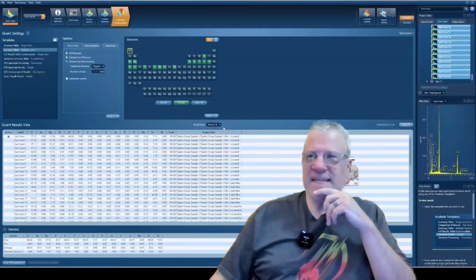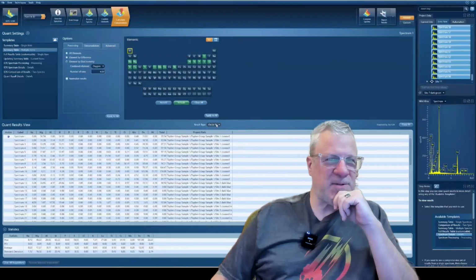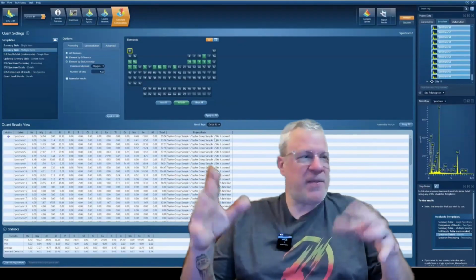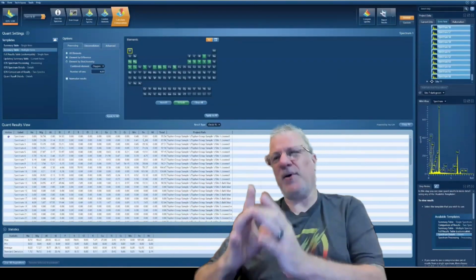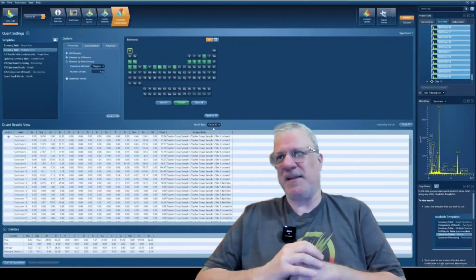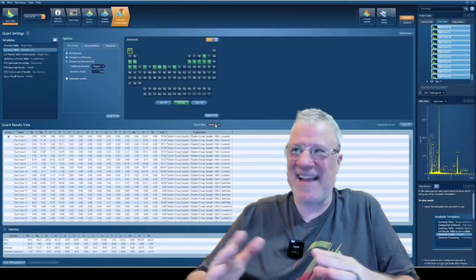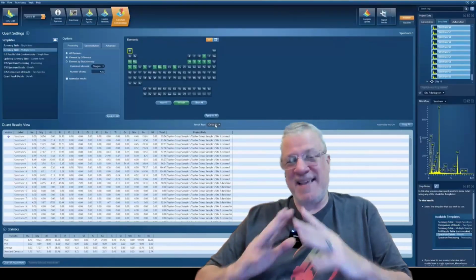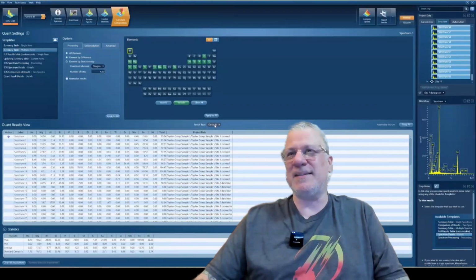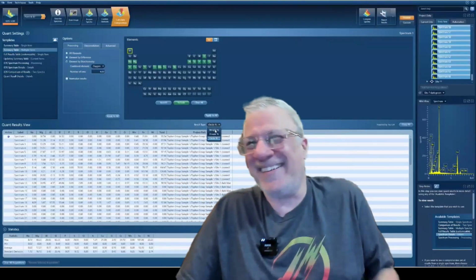Wow. 66 sites were sensed. That's crazy. I guess when I got into this years ago, I thought, testing a meteorite, you're going to zoom in on this little thin section and maybe take 10 readings, and if you're lucky. There's so much real estate on these things. That's the one thing I keep on saying, but it blew me away. You just keep on zooming in and zooming in and zooming in. Like, where do you want me to take the sample from? It's like, geez, 10 screens ago.